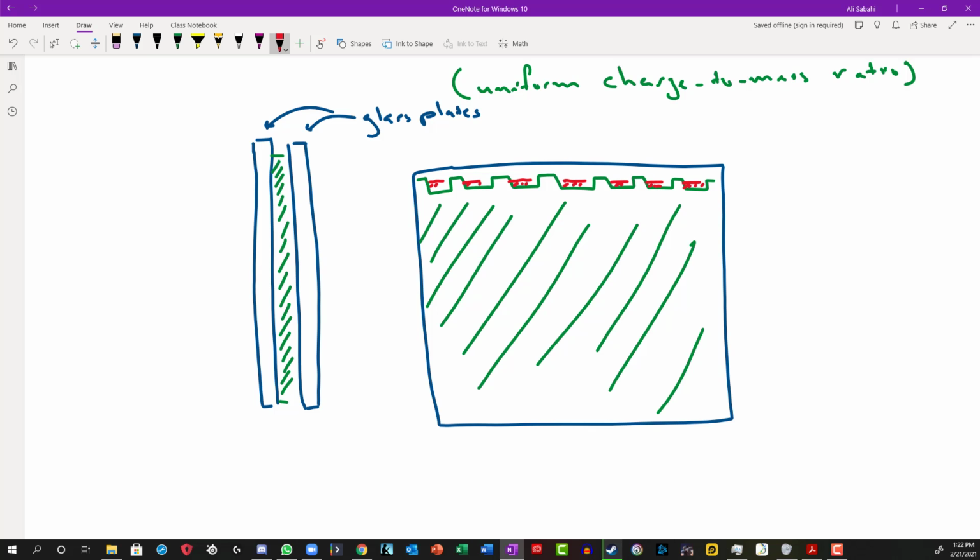And then you put this in a device that applies a positive charge on the bottom, below the plate, and a negative charge on top, a voltage. And remembering, since we treated our samples with this SDS detergent, the proteins will be negatively charged. So now your samples will run in this direction and will be separated based on their size.